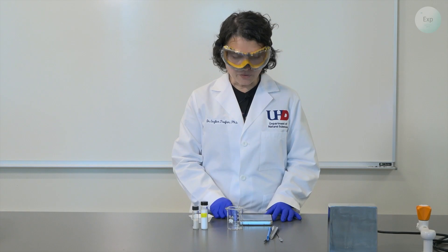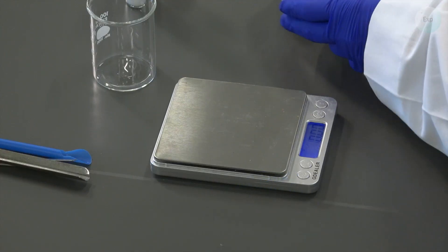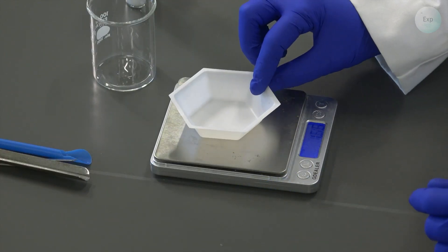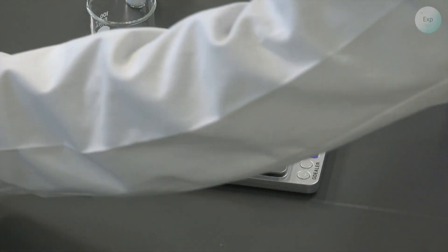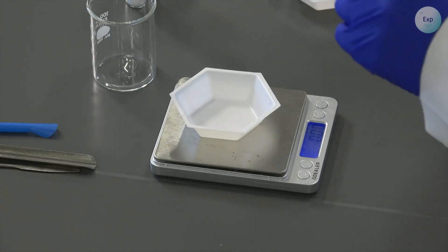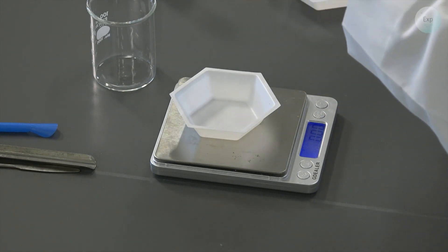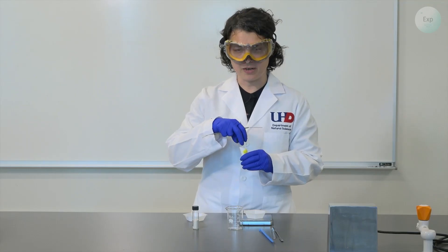So let's begin. First, we turn on our scale, then we place our first weighing boat on top of it and we tare. Then we take our spatula or scoopula and extract approximately five grams of sodium chloride from our container.